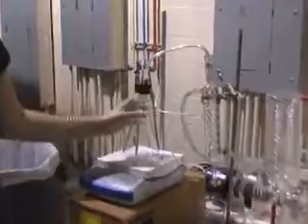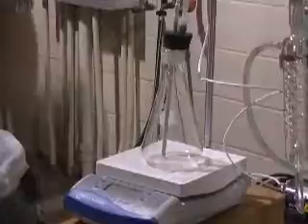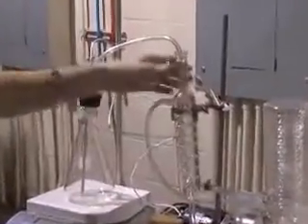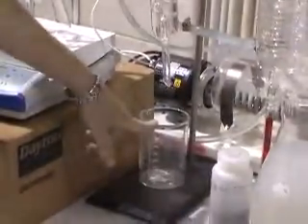The flasks that you saw inside the incubator will go up here and it'll be set to a temperature above the boiling point of ethanol but below the boiling point of water, because they have different boiling points. The ethanol will boil and the vapor will come into this little apparatus here. This is our condenser. We have cold water flowing through here that condenses the ethanol vapor as it runs down, and then we have liquid ethanol down here. It also helps to determine the amount of ethanol because once we've boiled this for long enough, we have all the ethanol in here and we can do the math and determine the percentage that we had to begin with.